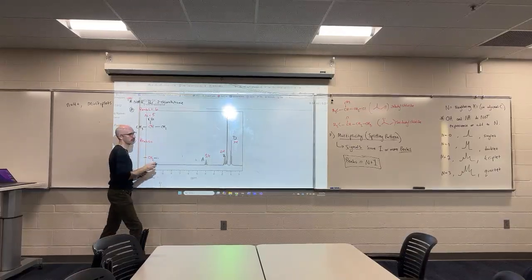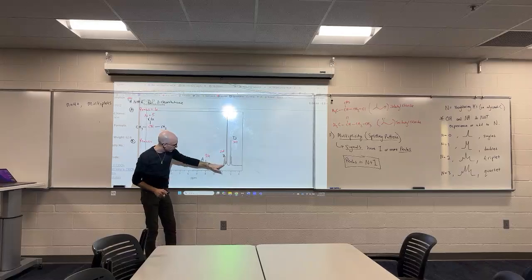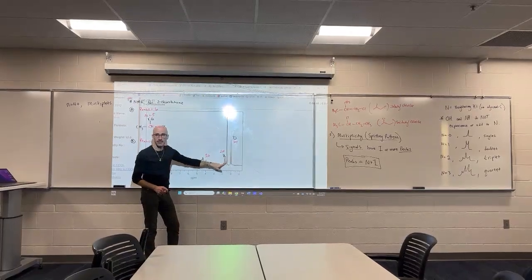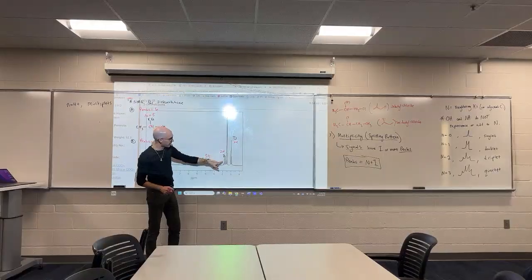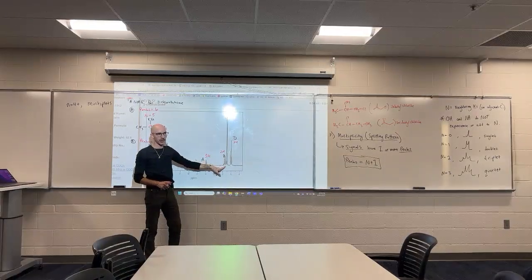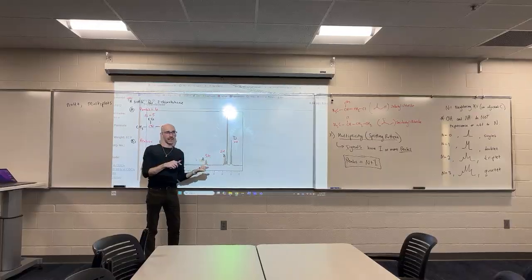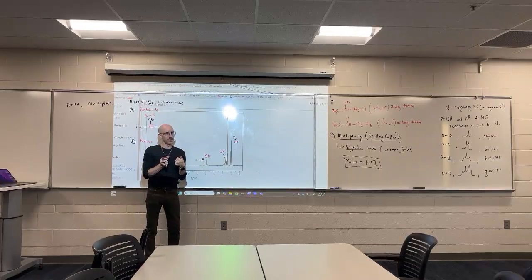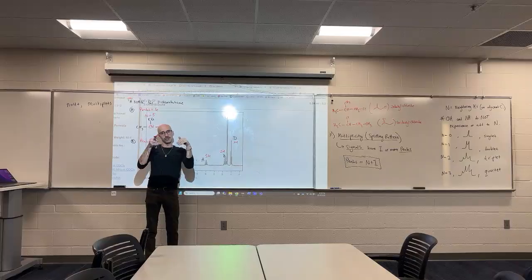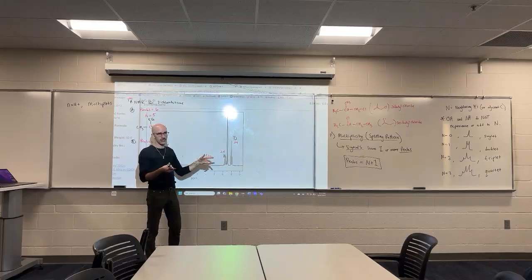Oh man, this is where experimental data really bites you in the butt. Notice how these peaks actually overlap. Signal B and signal C, they actually overlap with each other. I'm only telling you the integrations because I know it. But if I was on a software on a computer, I would have a hard time separating them. The computer can actually do some math to try and separate them. But otherwise, they would integrate together to 5H.